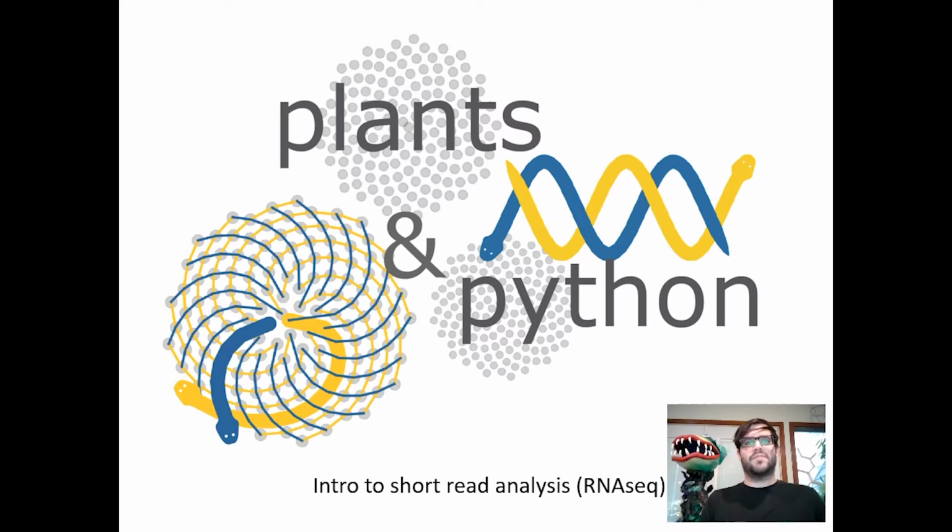My name is Bob Van Buren, and I am an assistant professor in the Department of Horticulture at Michigan State University. And in today's lesson, we're going to talk about short-read analysis using Illumina data and provide a general introduction to RNA-seq or gene expression analyses.